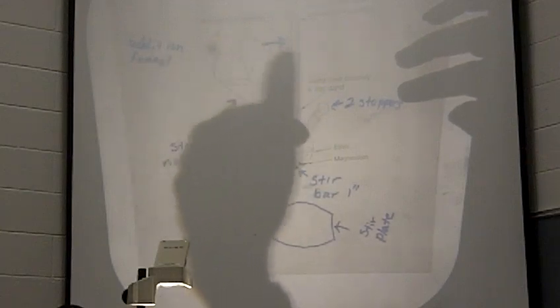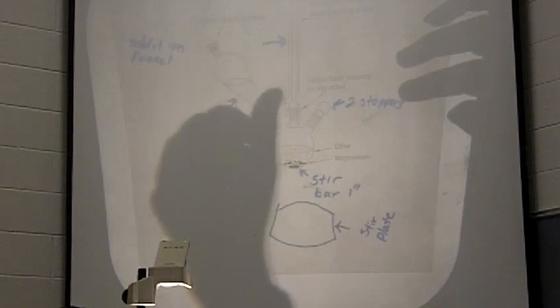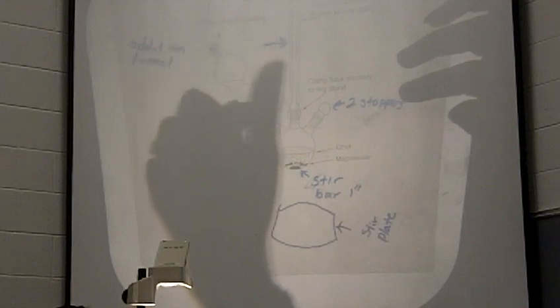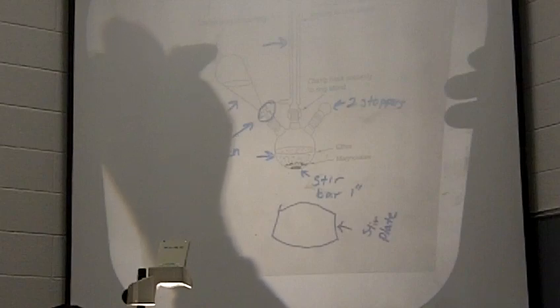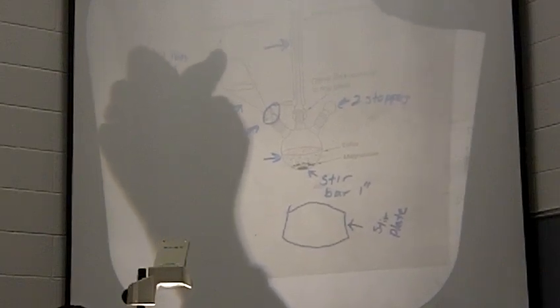It needs to go in there dropwise, all right? And so we're using our separatory funnel to control the addition and add it dropwise, right? So the stopcock has to be closed when you go to put your solution in your separatory funnel, right? And then you'll have a little bit of cotton in the top of the condenser, all right?